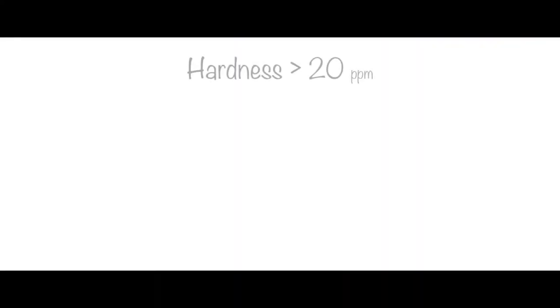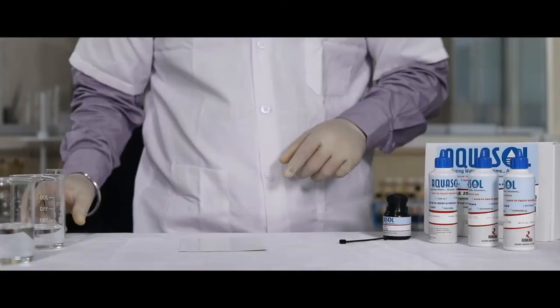If the sample is more than 20 ppm, repeat the same procedure. But instead of TH3 reagent, add TH4 reagent drop wise until the color changes to blue.